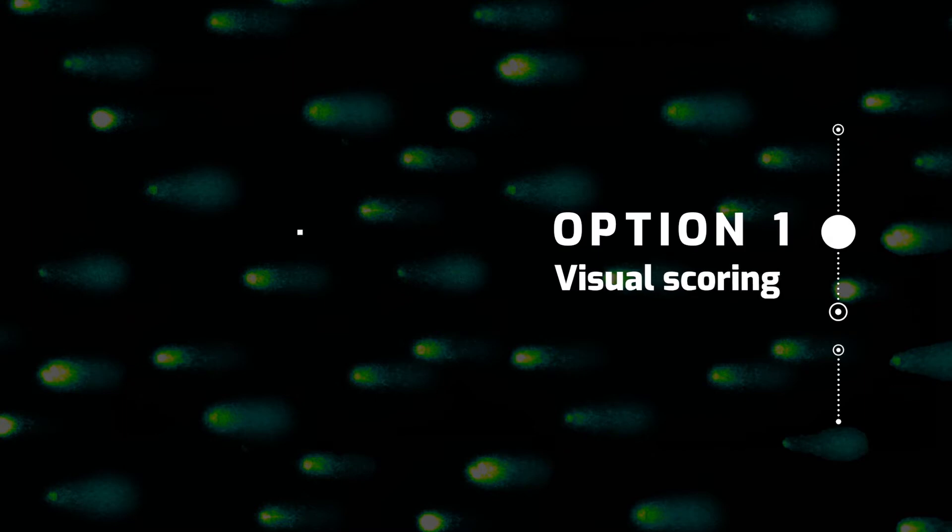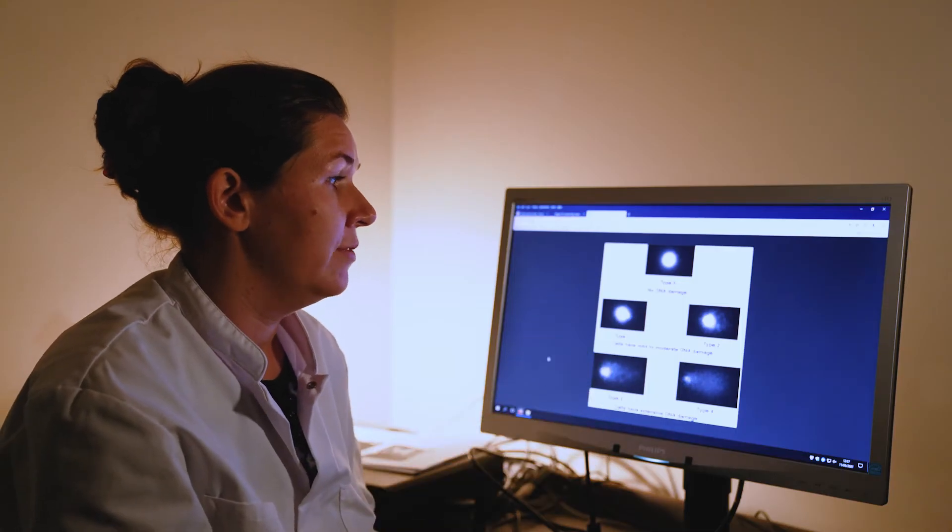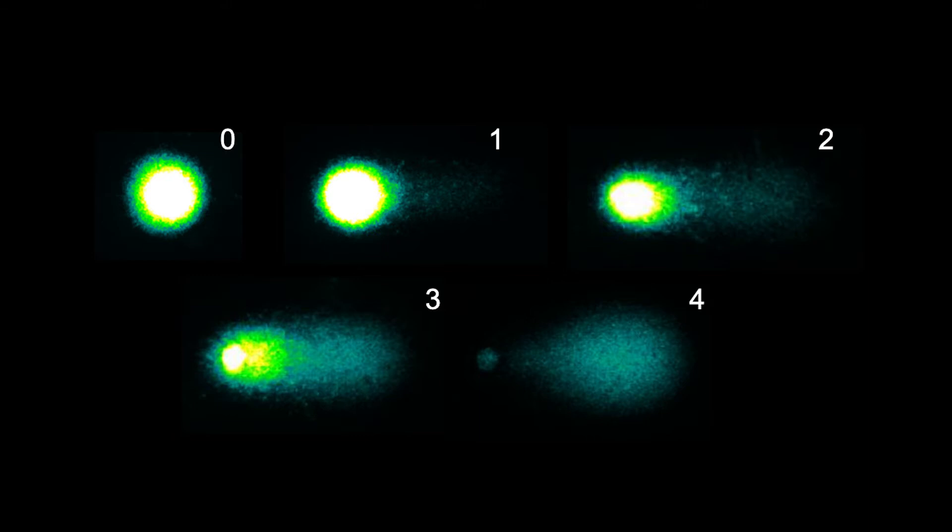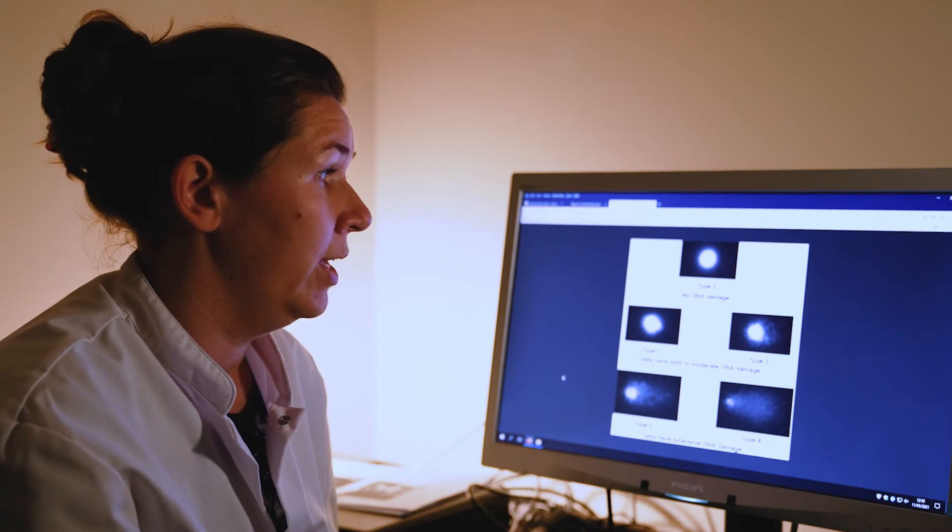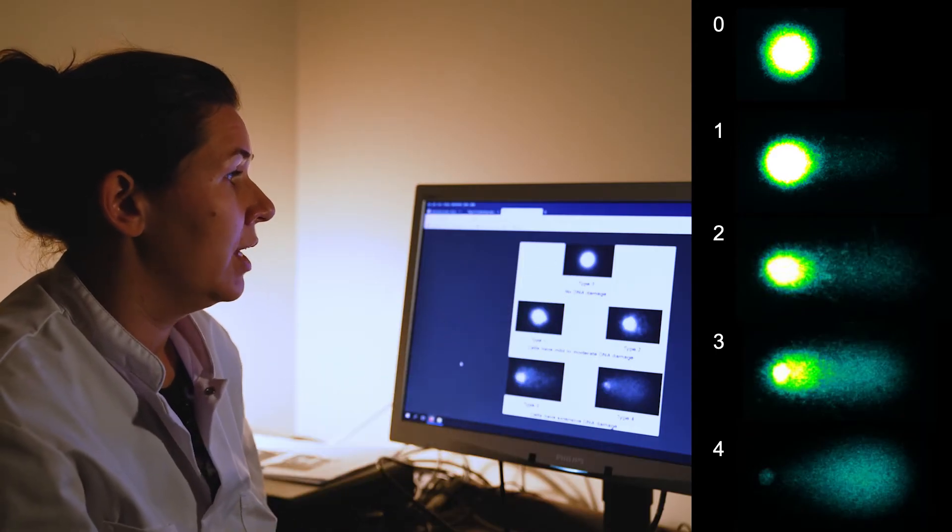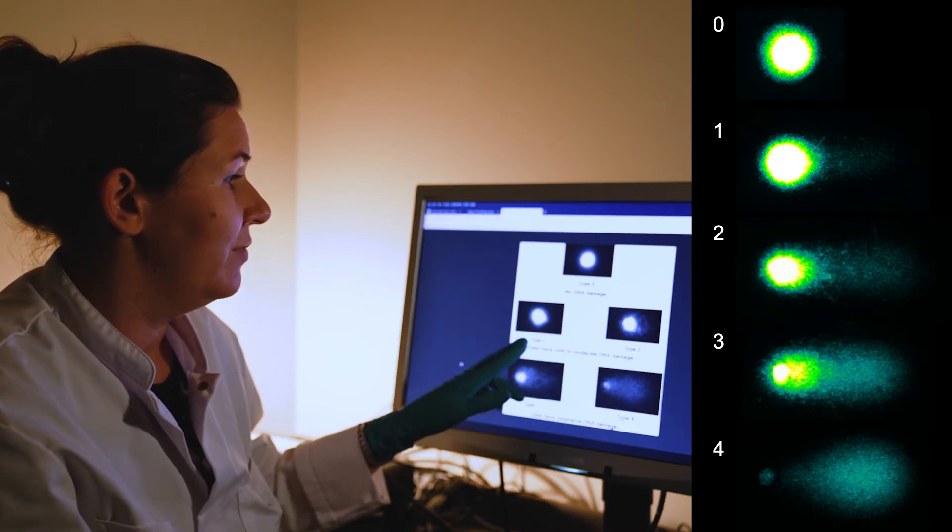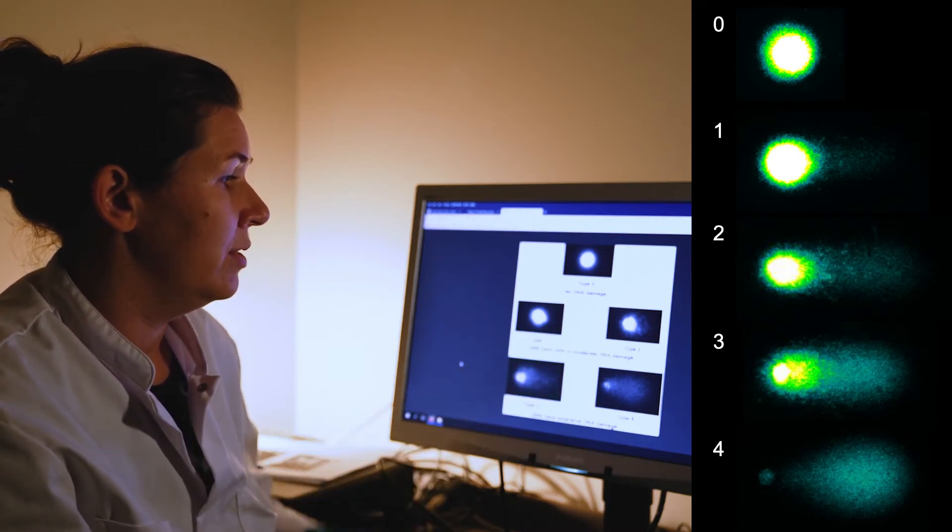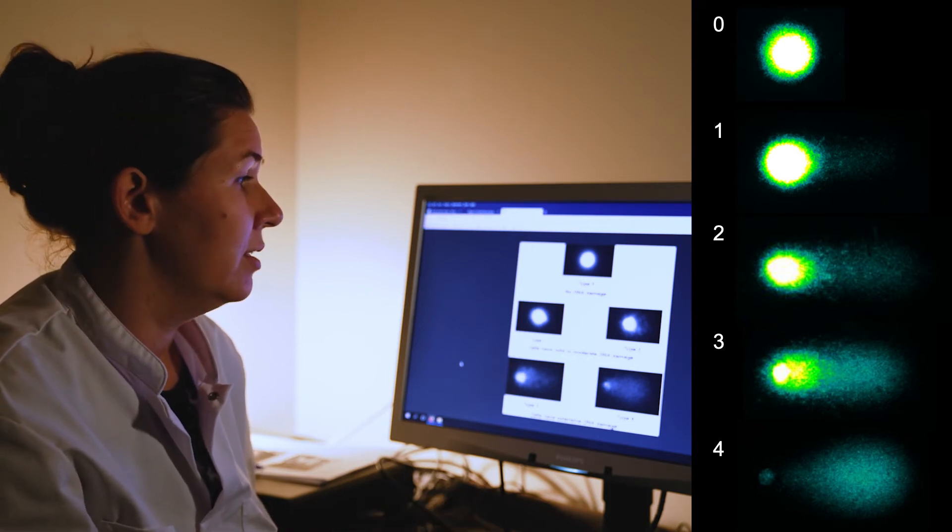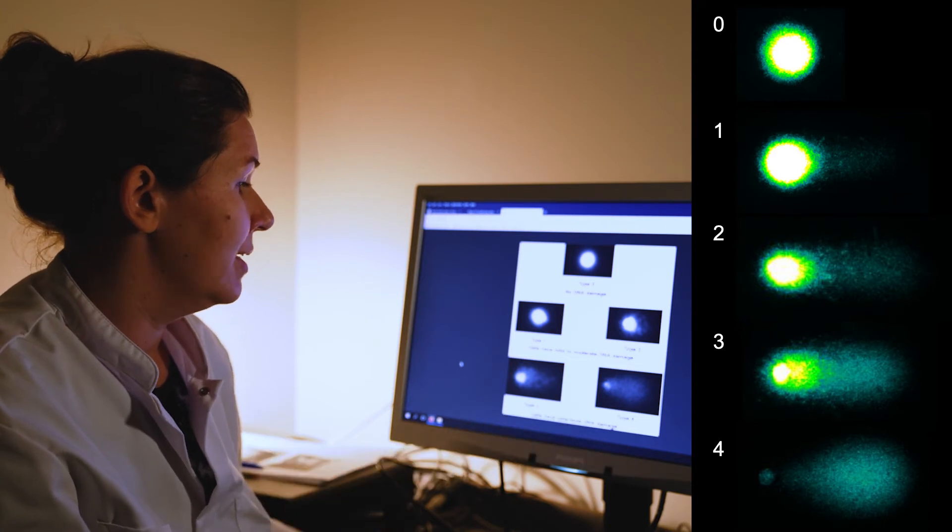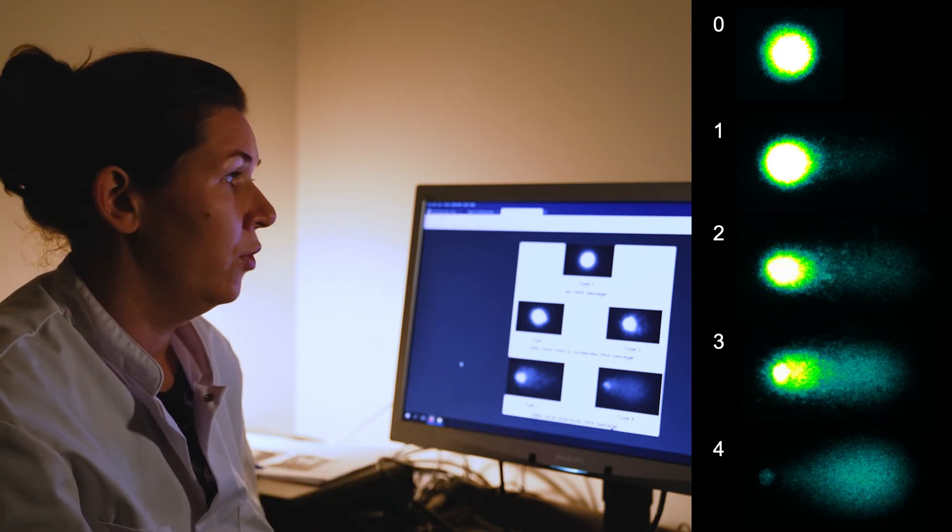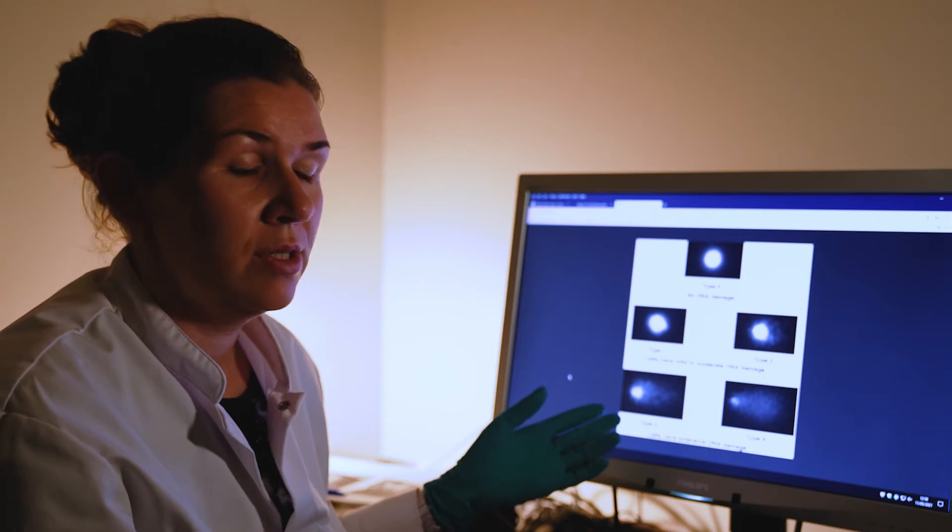So how do you do visual scoring? If you don't have any software program available, this is how you can classify the comets in five classes. Five because the human eye can only distinguish between five different classes in an efficient way. So the non-damaged comets are classed as type 0, then you have type 1 and type 2, which are moderately damaged comets, and then the highly damaged comets are classed as either type 3 or type 4. These are just examples of pictures.